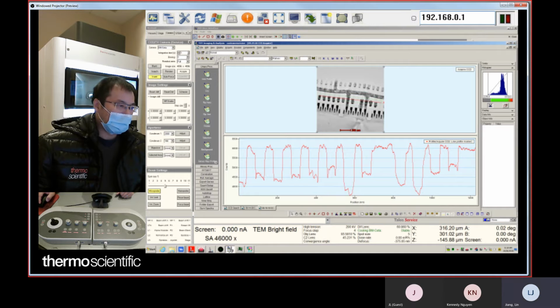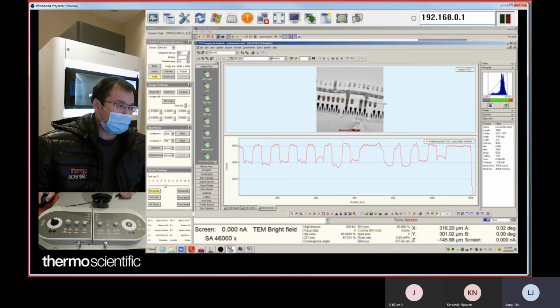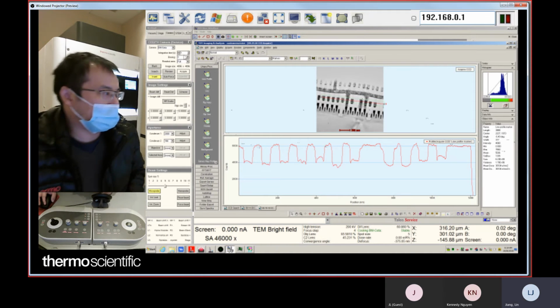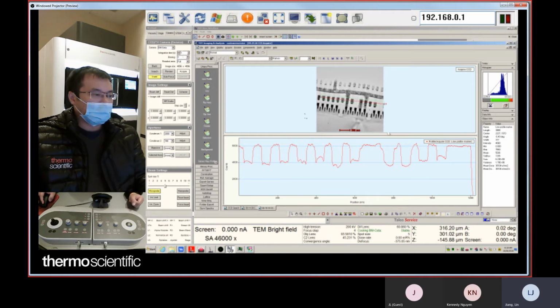It's well below the 8,000. So you can do the math to calculate the max integration time you can go based on the max count. Okay.